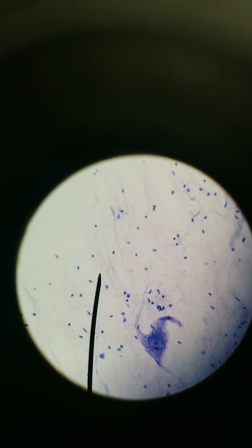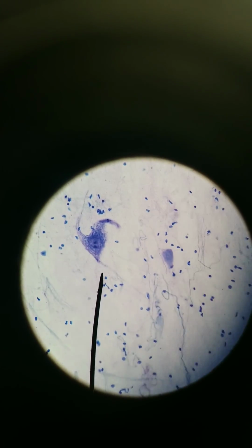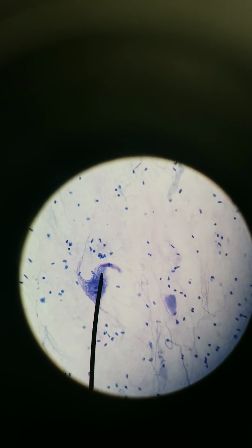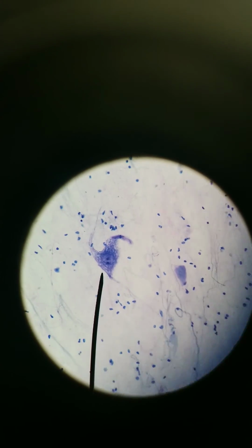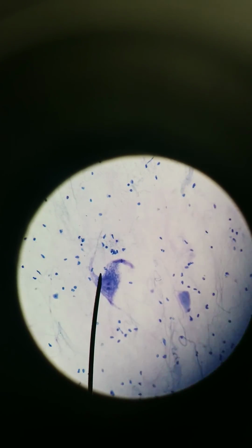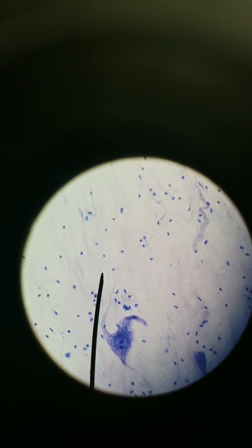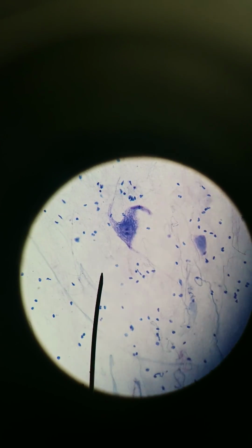Each neuron is unique. They're not shaped all exactly the same, but they all have the same branches, axons, and dendrites, but they can vary in how many they have. I would hazard a guess that this is a dendrite right here because it's darker. This is a dendrite as well. The staining gets lighter for this one. So I would conclude that this one is likely the axon, this extension. All right, so that is the basic anatomy of a neuron. This one happens to be a motor neuron, a multipolar motor neuron. We'll take a look at other shapes in another video.